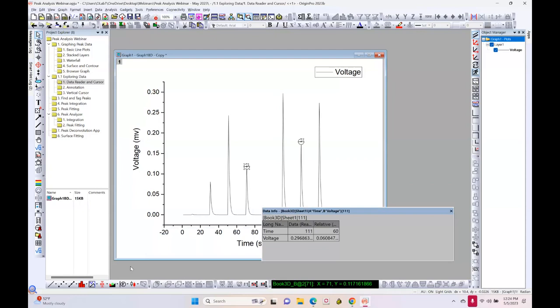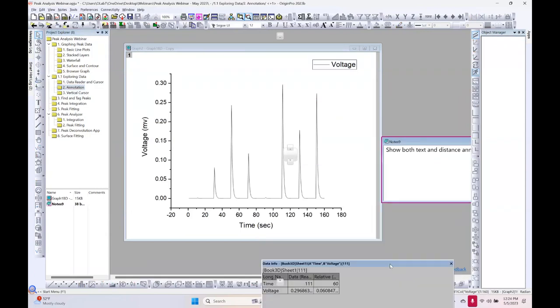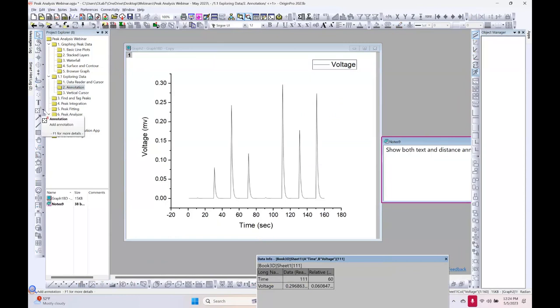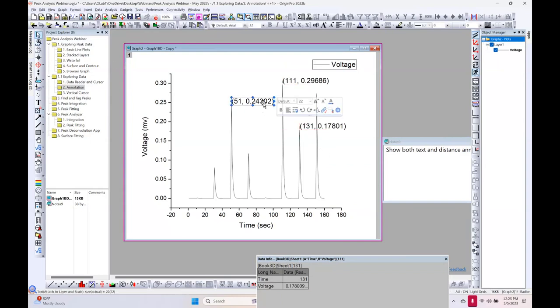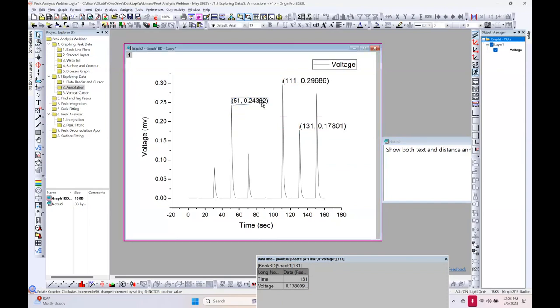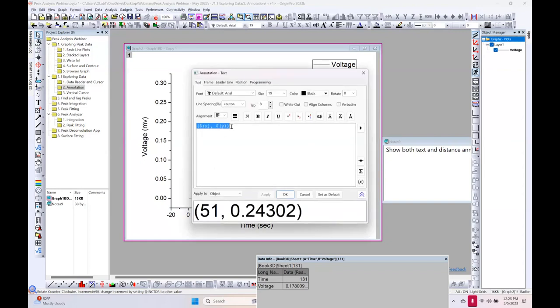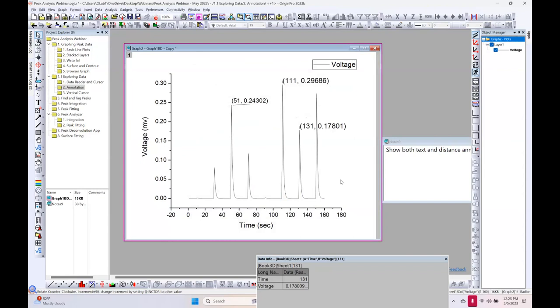Let's look at annotation. There is an annotation button in the toolbar. If I click on it and click a point on the graph and hit enter, I get the X and Y values annotated. You can further customize font rotation, placement of labels, and the annotation syntax — for example, using X and Y tokens — all of which is documented.